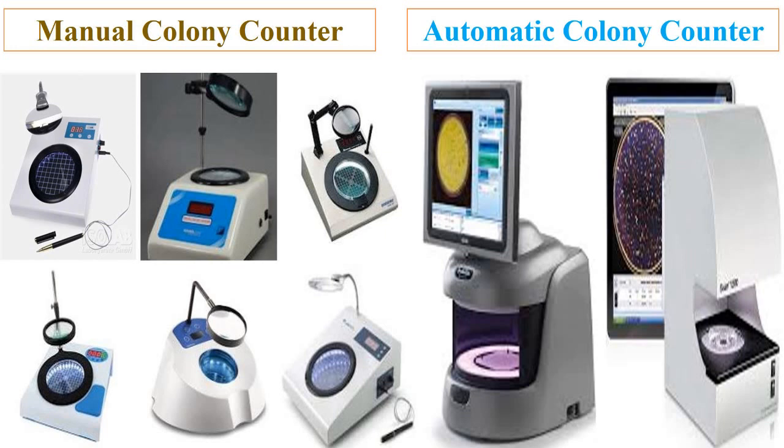Additionally, there are two types of colony counter: the manual colony counter and the automatic colony counter, as mentioned inside the slide.